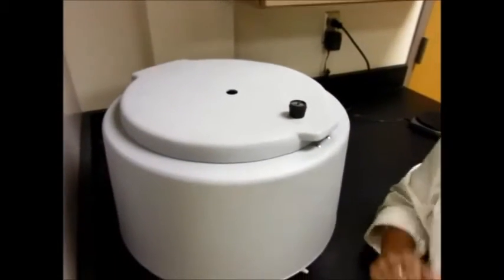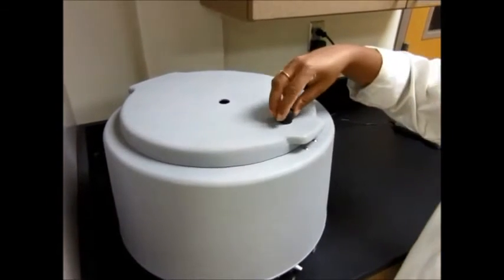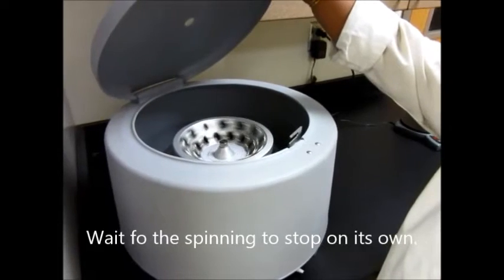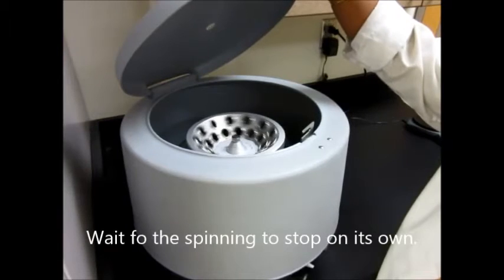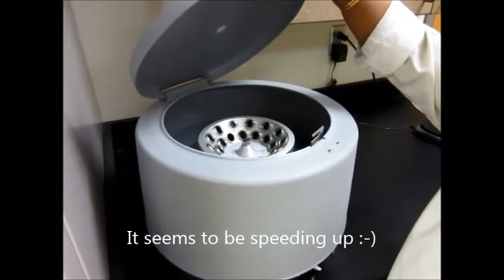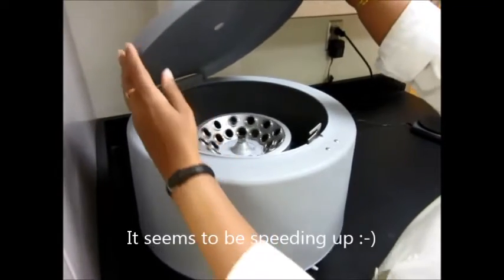You can see from the hole whether it's still spinning or not, or you can take a little peek from here. If it's still spinning, put it down and wait for it to stop. Do not use your hands to stop the spinning or you will hurt yourself. We'll just wait for it to come to a complete stop.